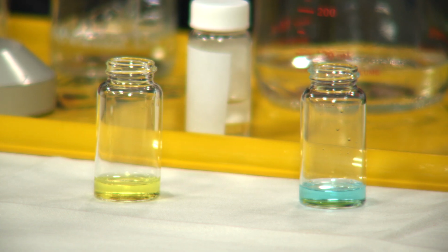Yeah, so you've got the yellow. So he's very nicely demonstrated that you've got... You can put them on the table, we should be able to see them against the white tablecloth. You can separate two compounds, but in actual fact, in some of the techniques, which are a lot bigger and more expensive, they can actually separate thousands of compounds in a sample. So this becomes a very, very powerful technique.